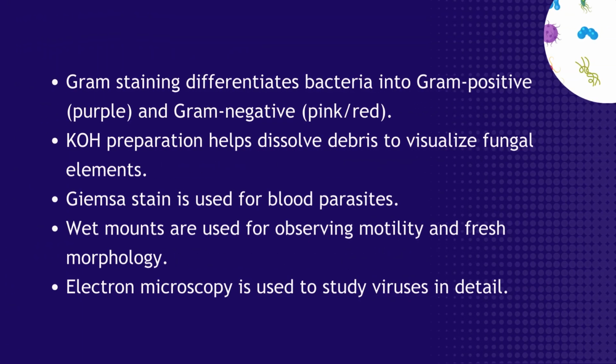Gram staining differentiates bacteria into gram-positive, purple, and gram-negative, pink-red. KOH preparation helps dissolve debris to visualize fungal elements. Giemsa stain is used for blood parasites. Wet mounts are used for observing motility and fresh morphology. Electron microscopy is used to study viruses in detail.